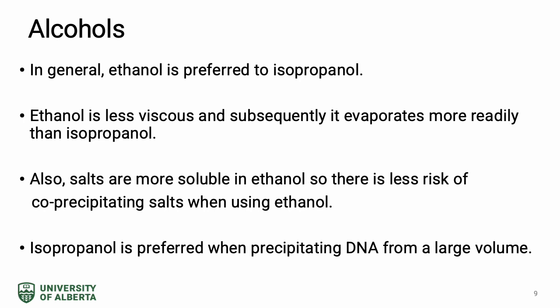Isopropanol is preferred when you're precipitating DNA from a larger volume. This is because you need more than 2 volumes of ethanol per volume of nucleic acid solution, whereas with isopropanol, you need approximately 1 volume of isopropanol to the nucleic acid solution volume.